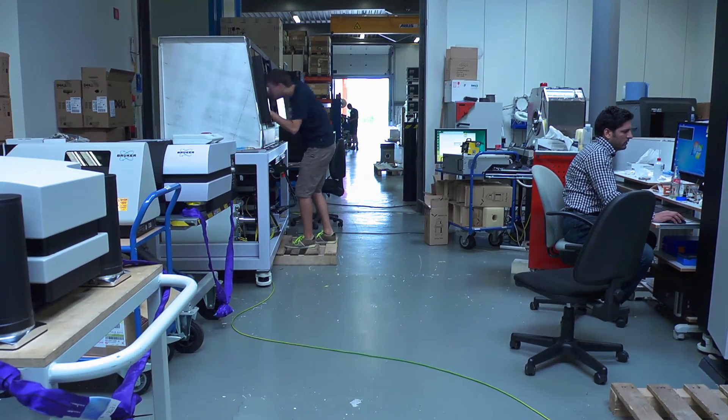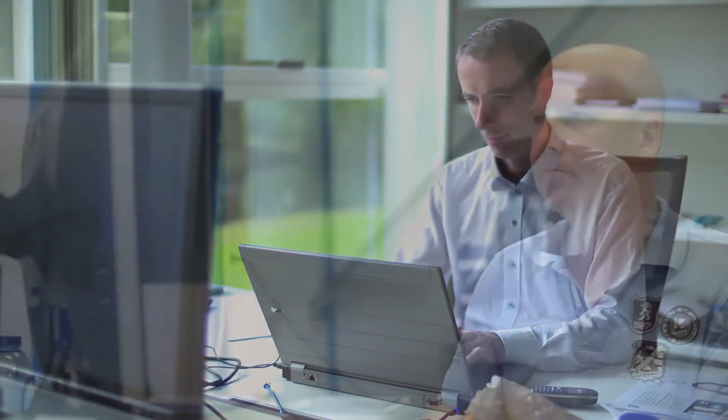In the same location in Belgium, we have core development, scientific group, sales, financial management, production, service support—all parts of a normal big company compressed to 33 people.